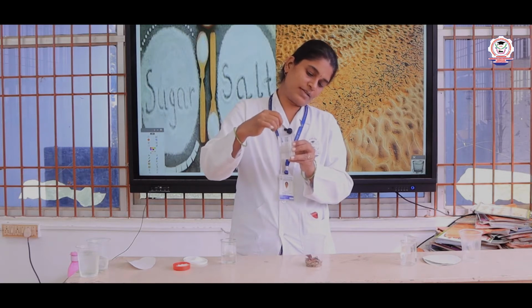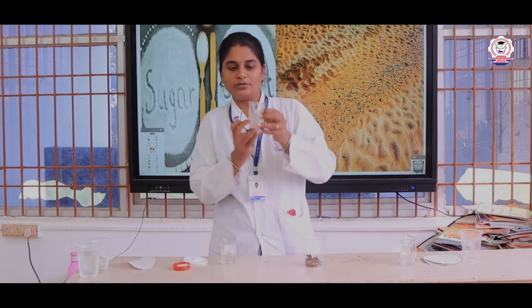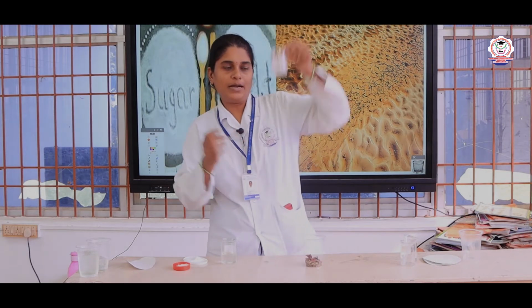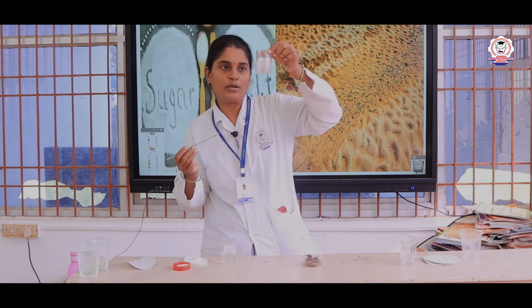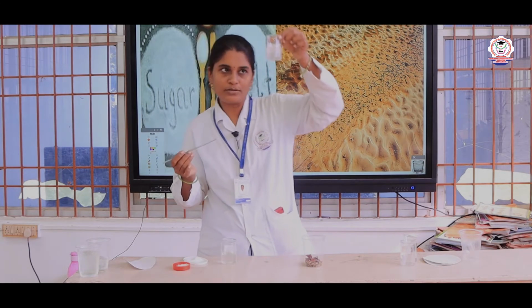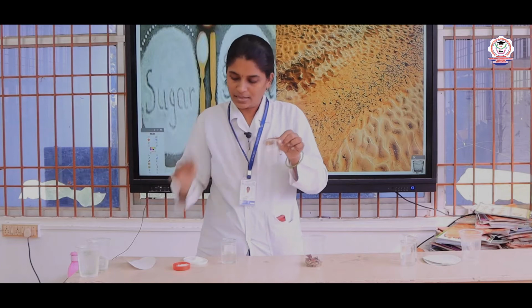The salt is completely dissolved, but the water is a little bit impure. Why? Because the salt is soluble in the water. You can see the salty water. So, we can say the sugar and the salt are soluble impurities.